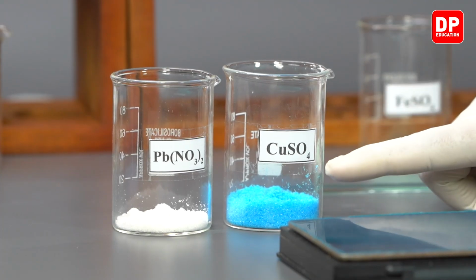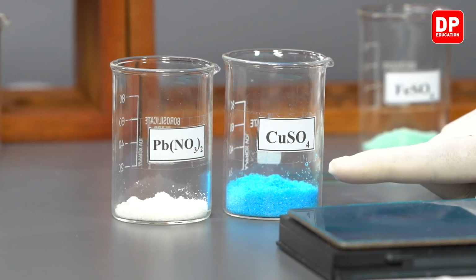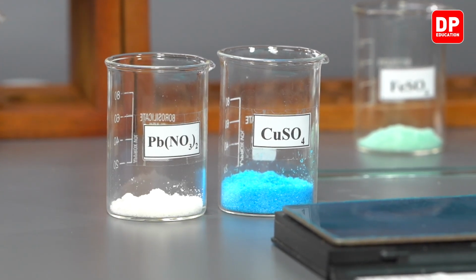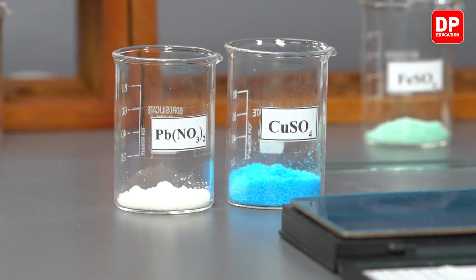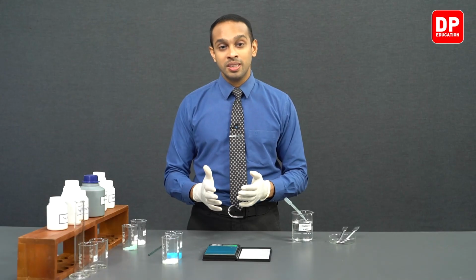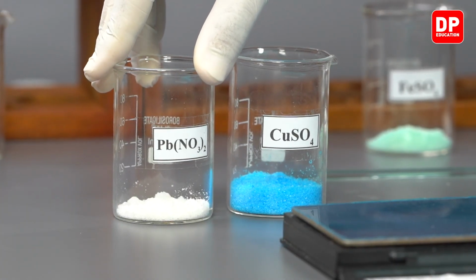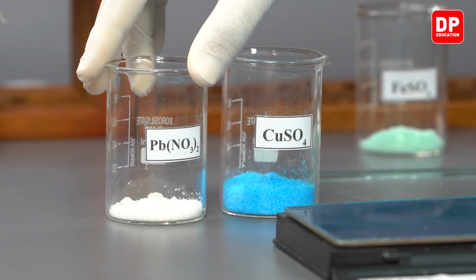Over here, when it comes to copper sulfate we measured 16.9 grams, and over here when it comes to lead we measured 16.6 grams. Only 0.3 of a gram difference is there. However, you can see the difference in the amount of solid we have taken. So copper is a lighter metal than lead, so that is why when it comes to lead nitrate, a smaller amount of substance is going to have a greater mass.